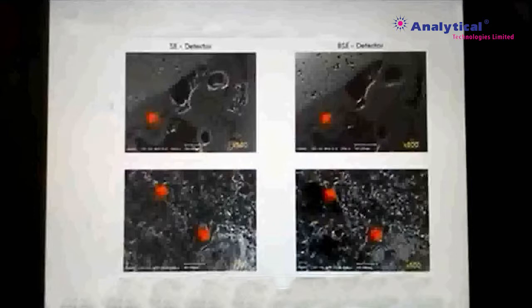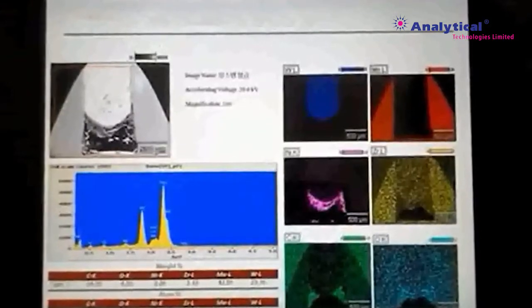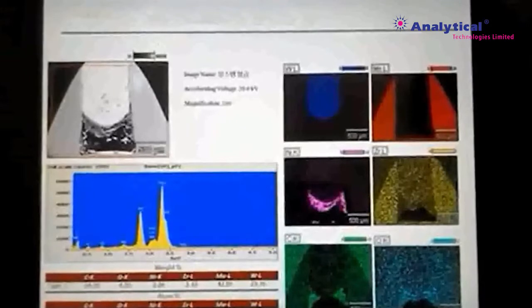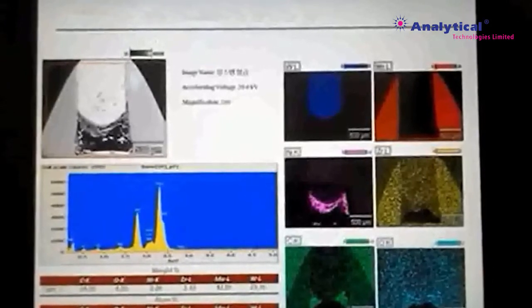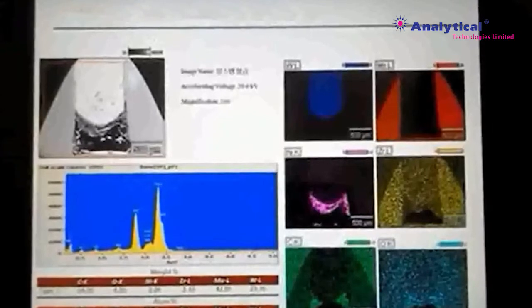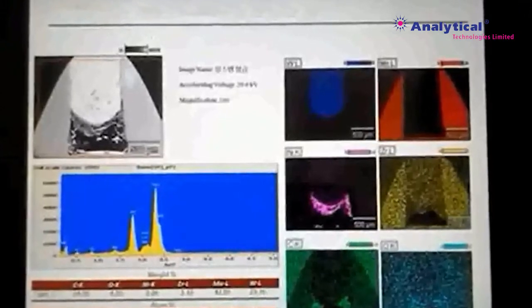Moreover, by collecting the backscattering electron, also known as BSE, by BSE detector, we can observe the morphology of the specimen. Constituent analyzer known as EDS can collect a specific X-ray to analyze the specimen's constituents. The reason why EDS analyzer is useful is that we can use the microscope to observe the sample and know the constituent at a specific position easily and fast.